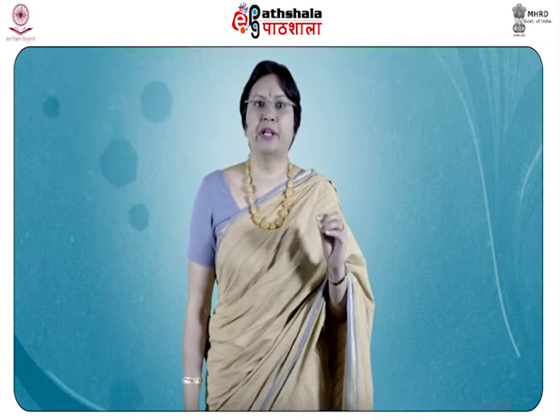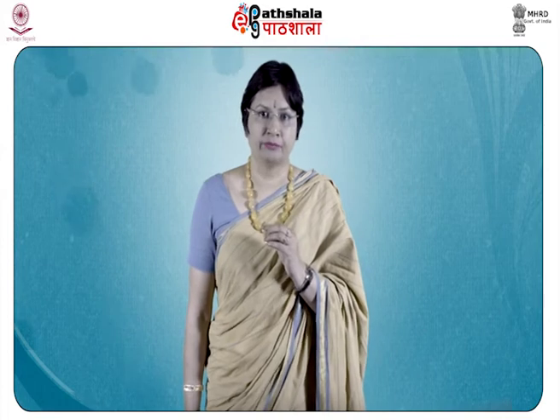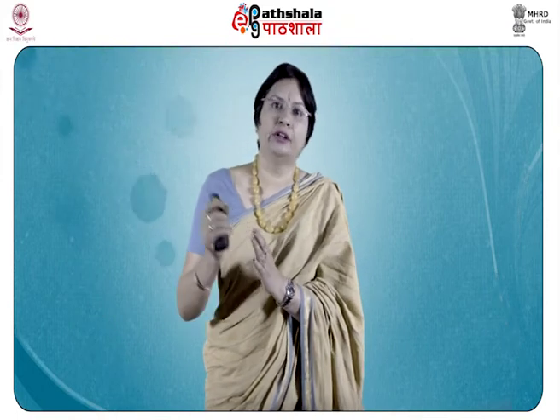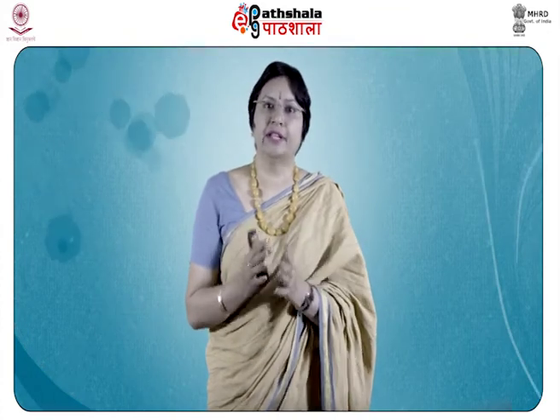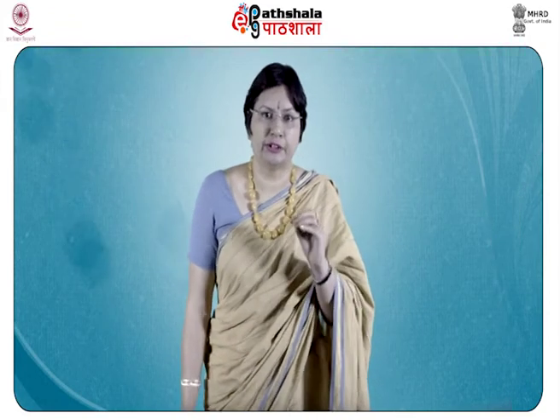The test must be carried out along with the reference standard as blank. So, when you are in a forensic lab, you take a known cation and carry out that test, and with the evidence or the sample you have collected from the scene, you also conduct the similar test and just compare. That will guide you whether the test is positive or not.